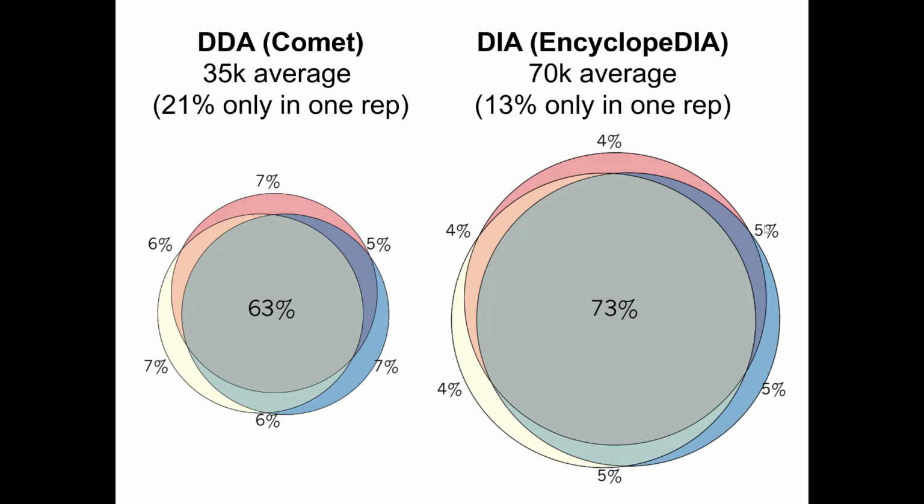Rudy showed slides sort of like this, but I think this is pretty important. DDA is a good method for profiling peptides and proteins, but as we are improving methodologies with DIA, we typically are seeing at this point somewhere between 20 to 50 percent, or even 2 times, as many peptides as we would typically see in a DDA search analysis method. And that's, I think, a really strong case for using DIA, but it's not the only case for using DIA.